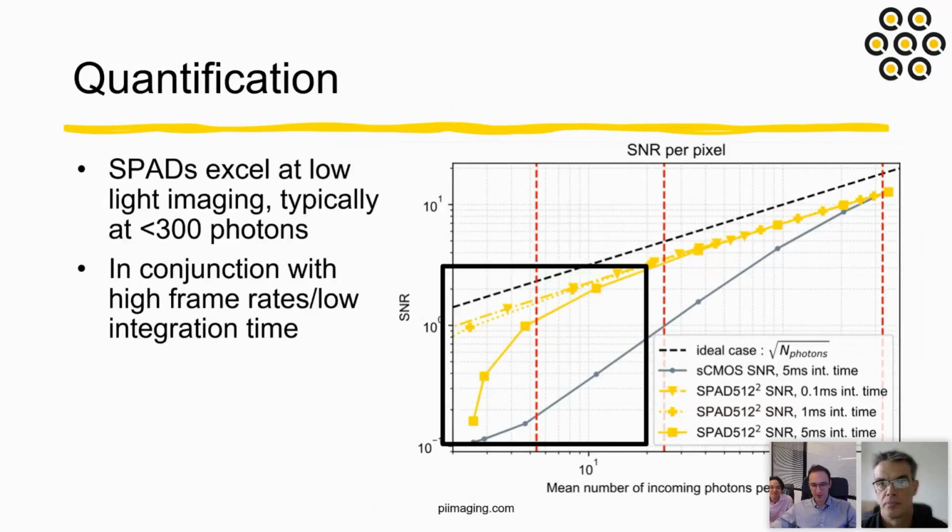So in this webinar, we focused on confocal microscopy. There SPADs excel because they have pixelation. So they offer you to improve the resolution by a factor of 2 purely because they have pixelation. Details on that can be found if one searches for image scanning microscopy. This is really great theoretical work done by many researchers. SPADs enable this super resolution.